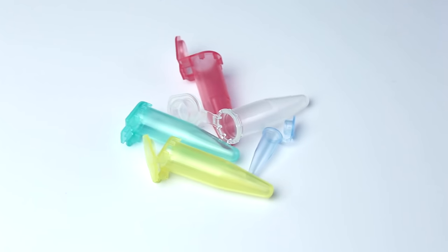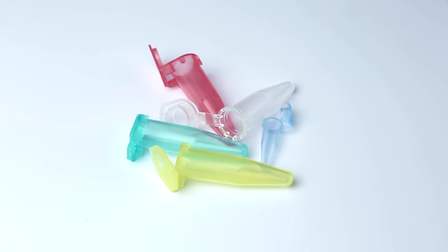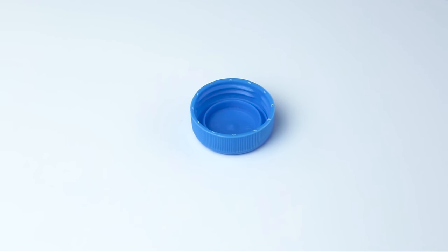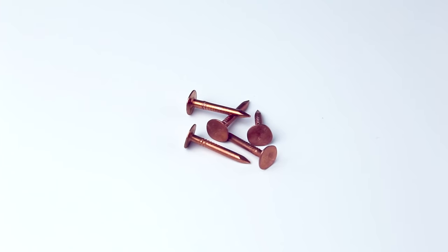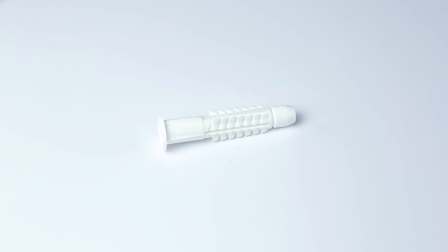Have you ever thought about what makes plastic parts so durable and safe? If construction materials had internal faults or voids, would they still be strong enough?